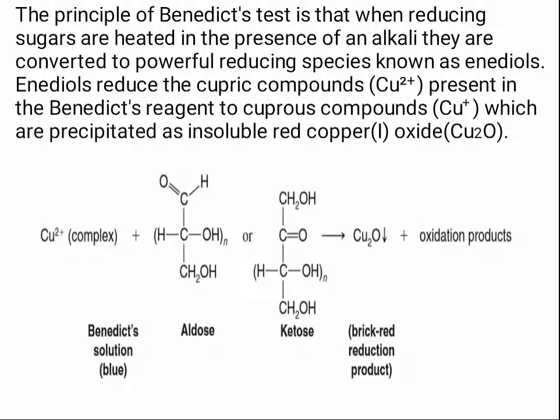So in case of Benedict's solution, Cu2+, which is a cupric complex, is present, and it reacts with the aldehyde group, and the aldehyde or this keto group is oxidized. Then we get oxidation products, and this copper 2+ is reduced to copper(I) oxide.